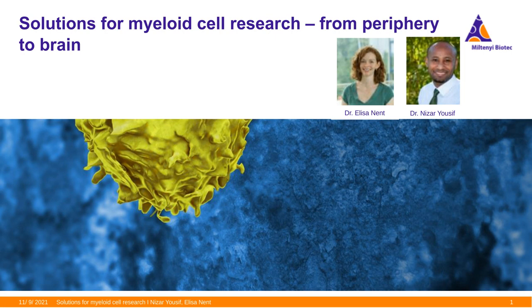Okay, I think I can try to answer this. It's a bit tricky to distinguish monocytes from microglia, since they're quite similar. And we don't have microbeads for rat monocytes, so it wouldn't work with microbeads and magnetic cell isolation. But what I would suggest is to use, for example, the Tyto cell sorter. So you could sort your cells and you could use different kinds of markers. Either you go for CD11b, CD45 high. You could also go for Ly6C high or CCR2 high.